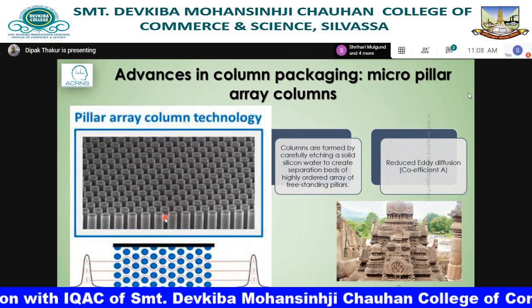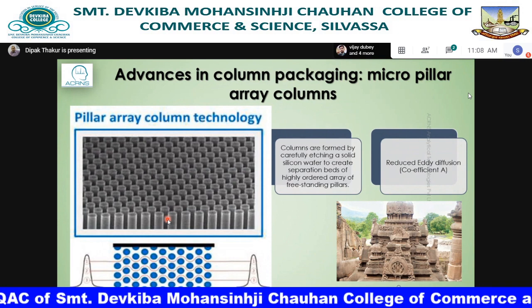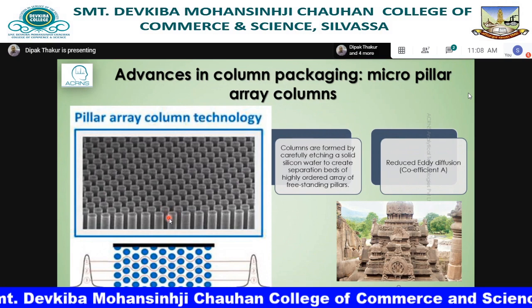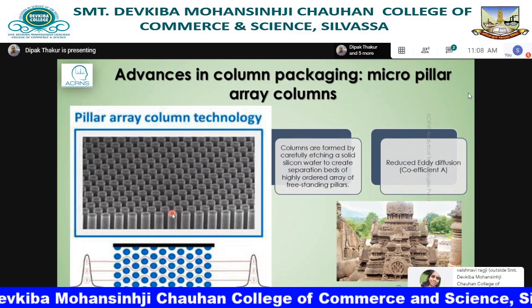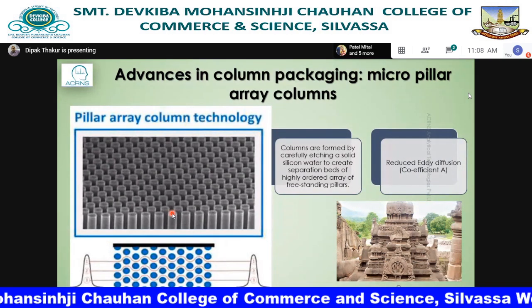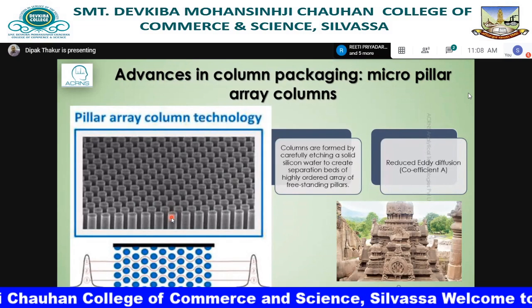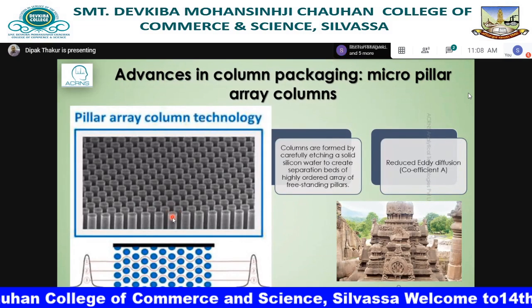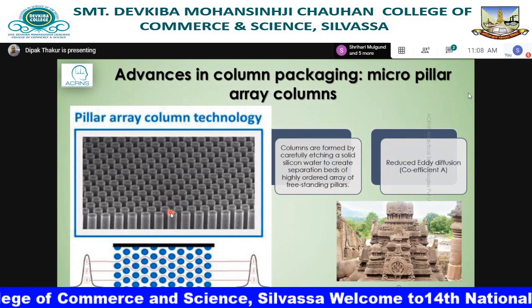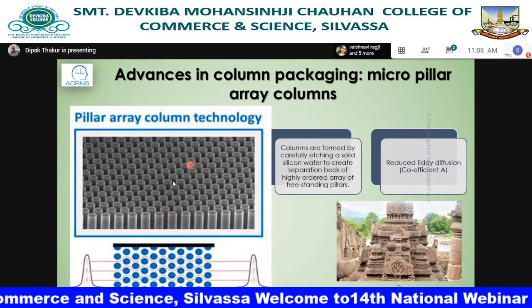The space between the two pillars is 2.5 micron. And if you see, the outer surface of this pillar is porous. Porosity is 30 nanometers, and the edge is only porous, not the central part. And that is, the porosity is up to 300 nanometers. And see the uniformity of the pillars formed.